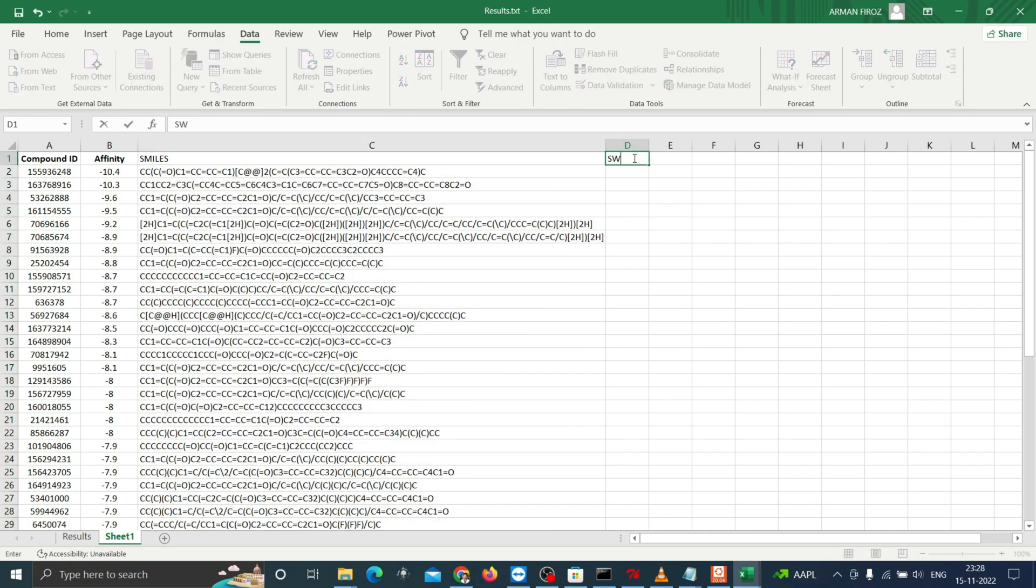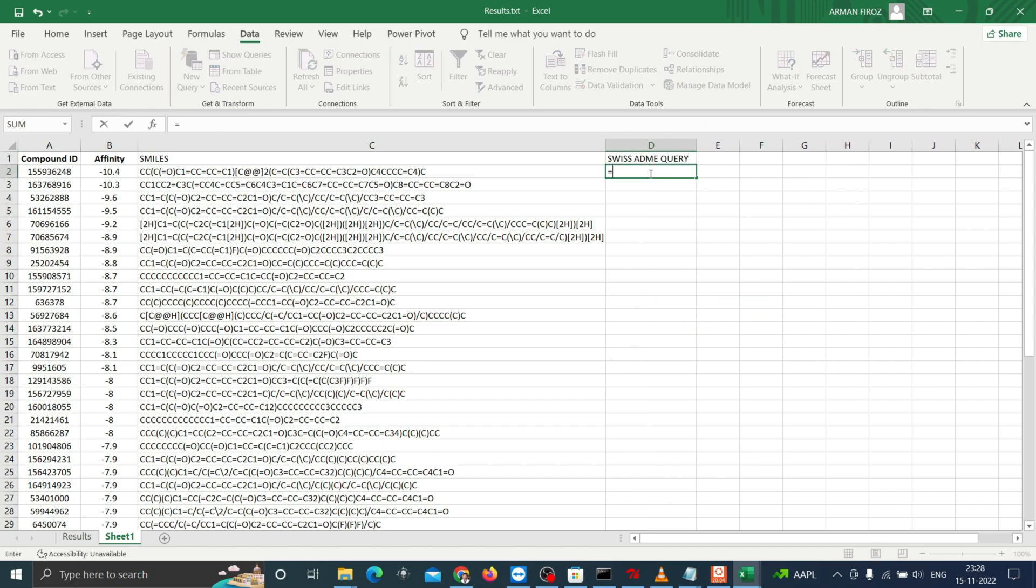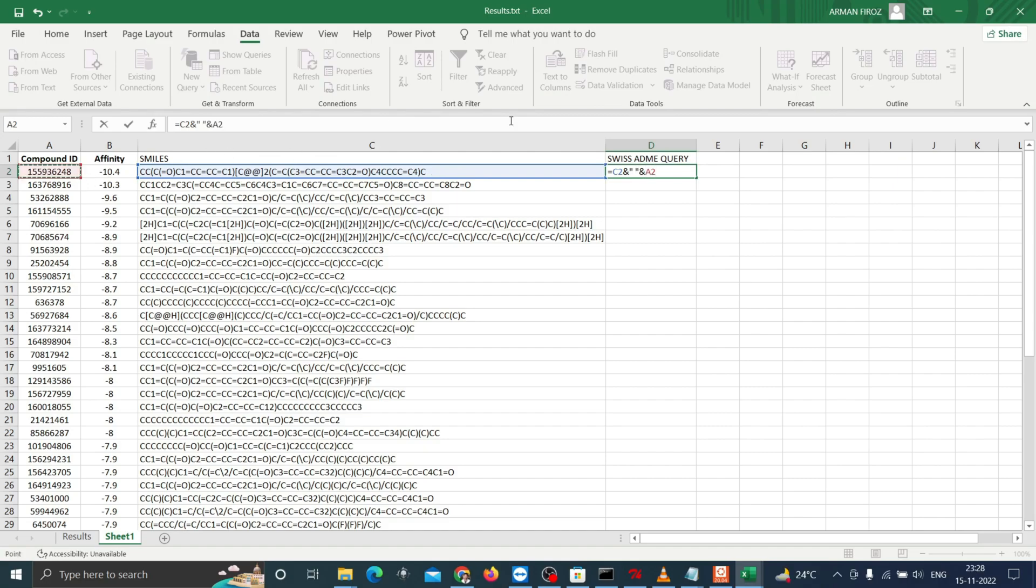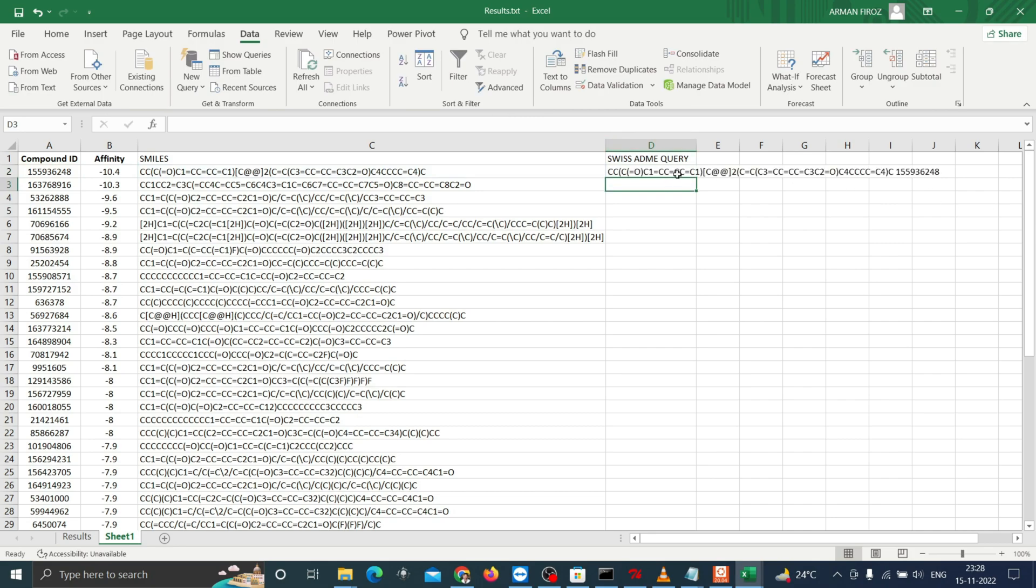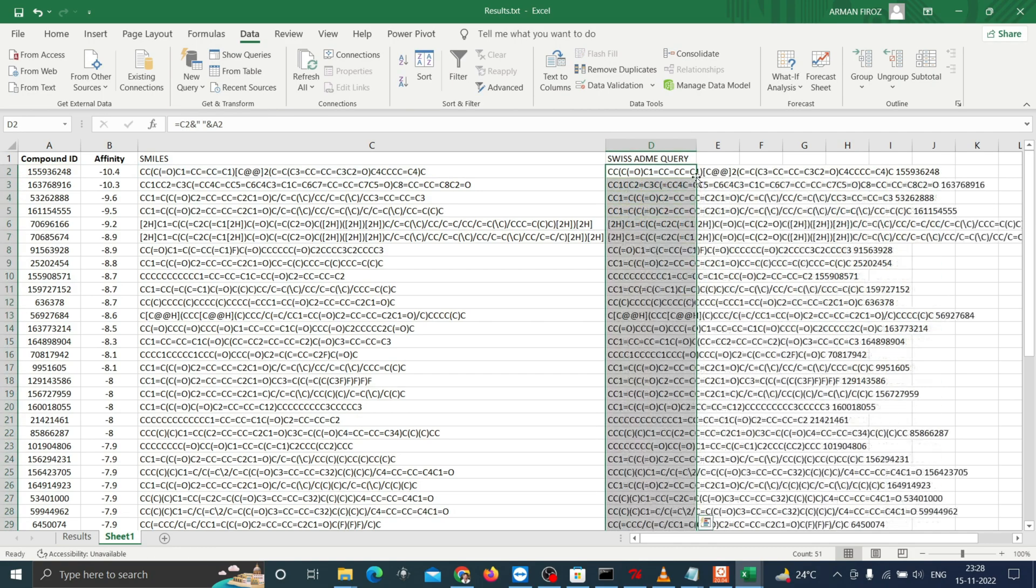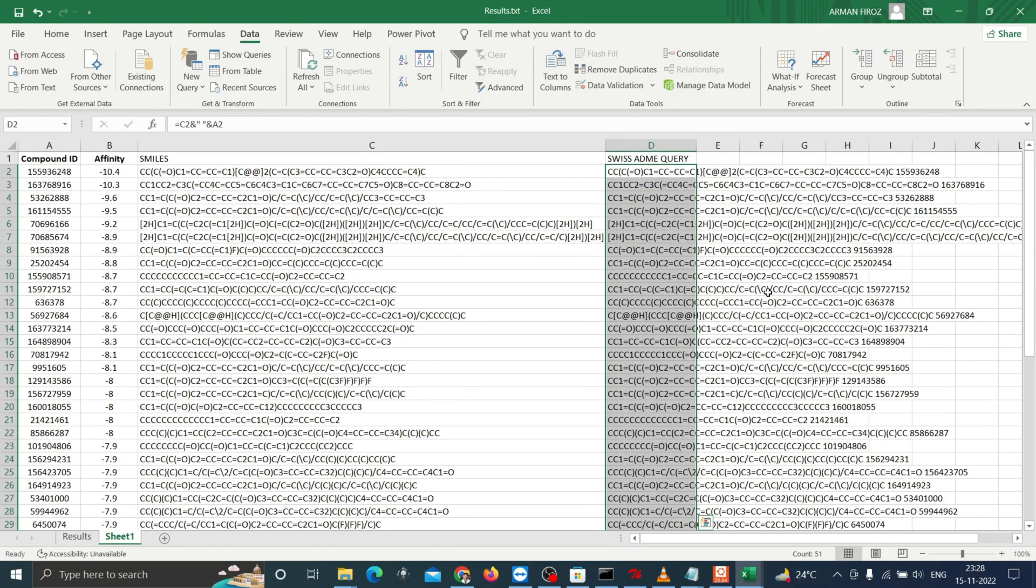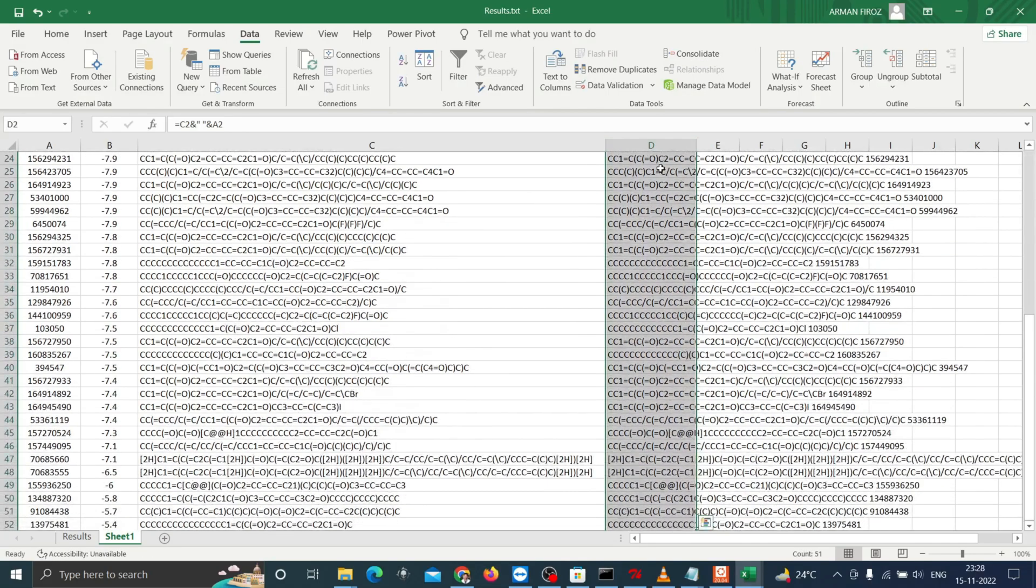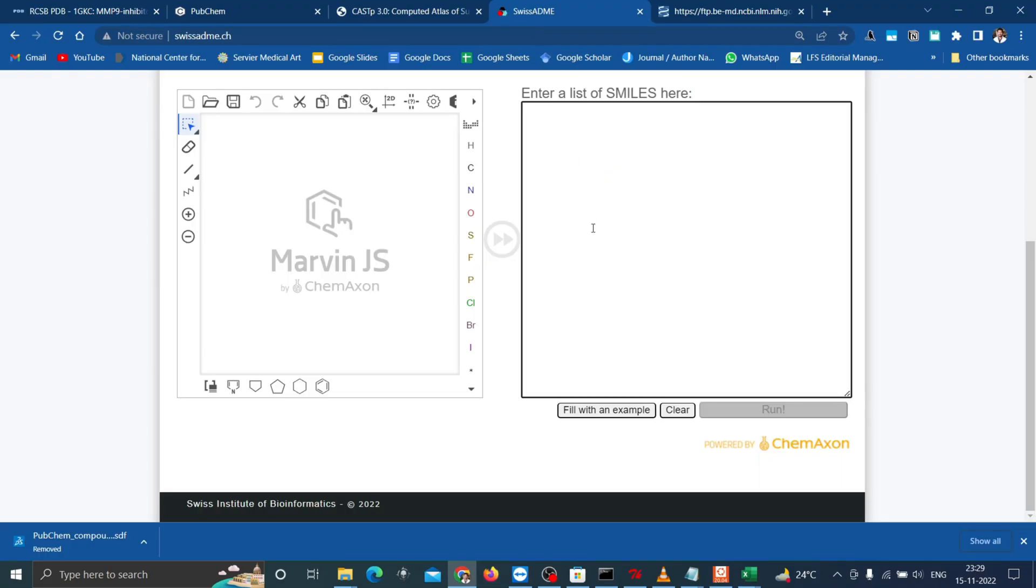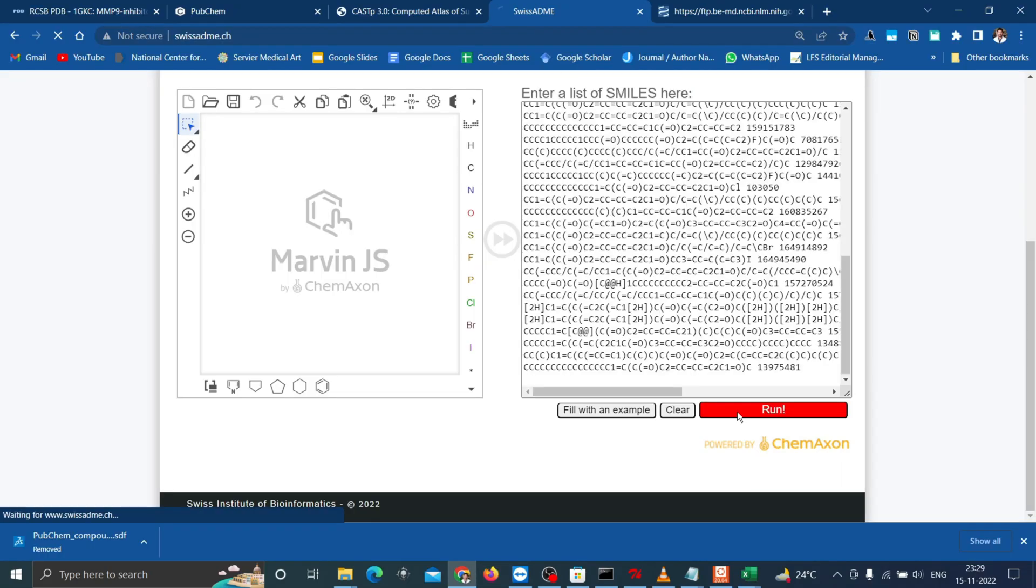Now let's make the SwissADME query list. Type equal to, then click on the SMILES and type & symbol, quotation, space, quotation, & symbol, and then click on the compound ID, then press enter. Double click on the plus button at the corner of the cell to get the entire results in the same column. Now copy the SwissADME query and paste it here and run. Within a few minutes you can retrieve the results.